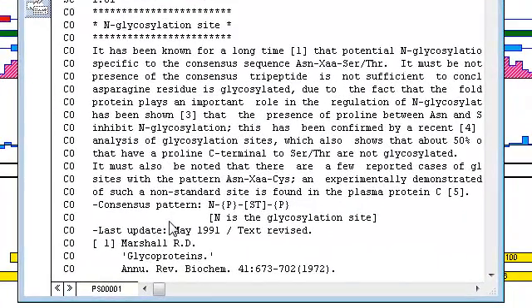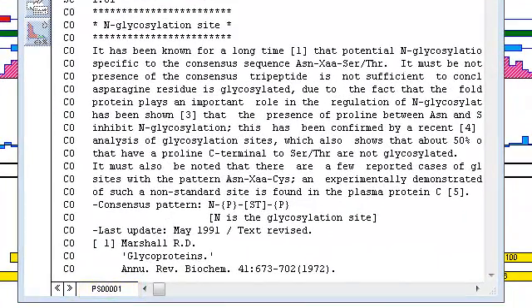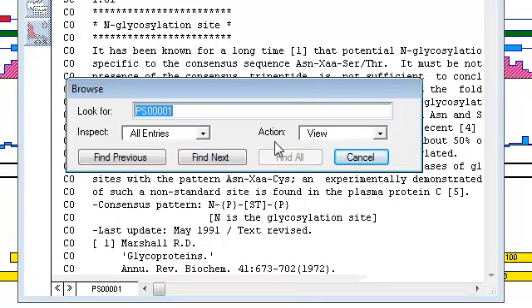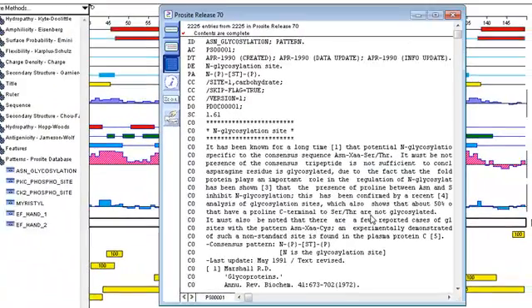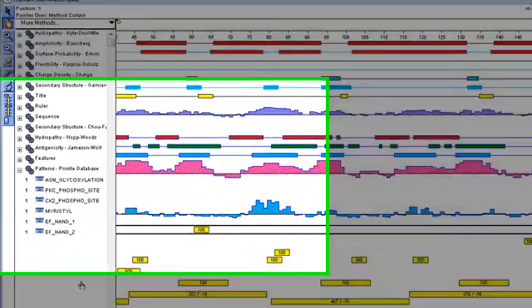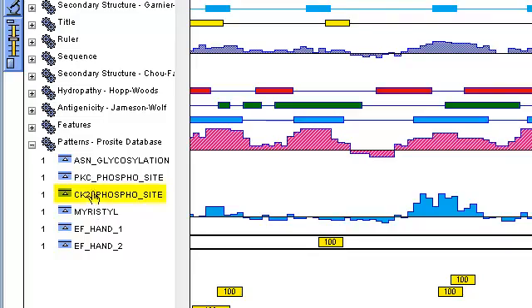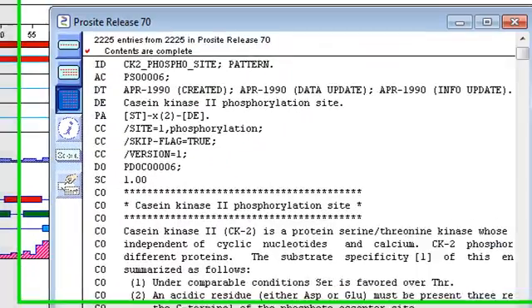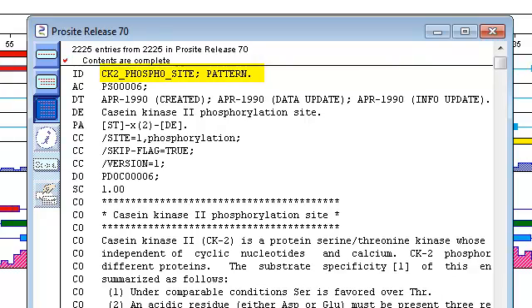You can also search the database by clicking on this field here, which will bring up a browse dialog, and then you can enter the term you want to search for. Also note that while the ProCyte database window is open, if you double-click on a pattern name from the method curtain, that will automatically show the full report for that pattern in the database window.